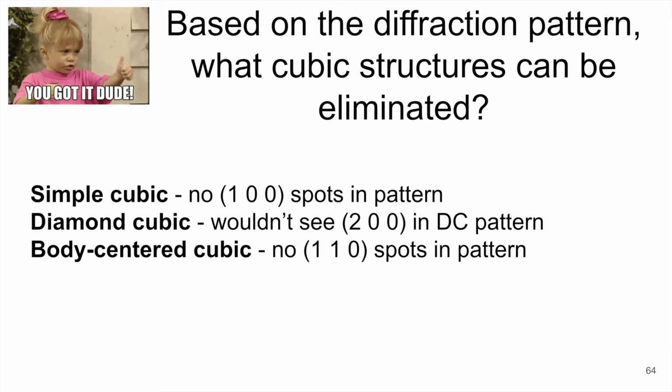All right, let's go back. And I apologize if you can hear my cat in the background, but let's go ahead and go to the next one. Let's look at body-centered cubic.